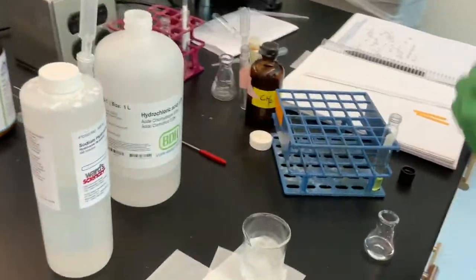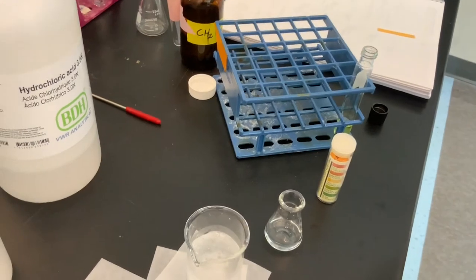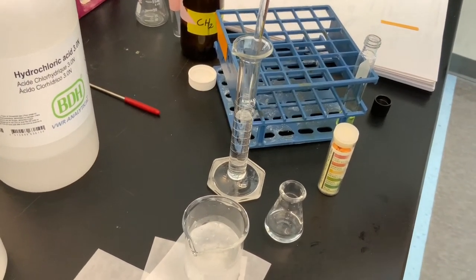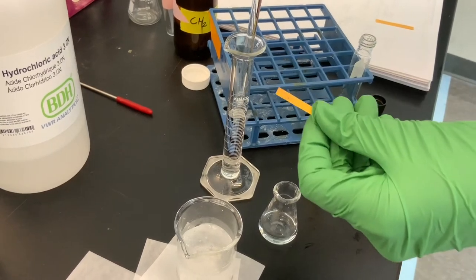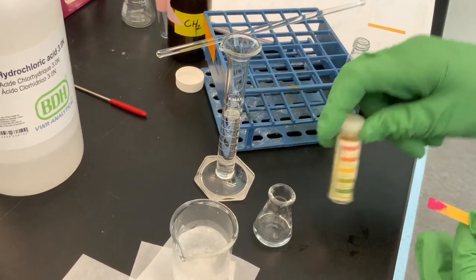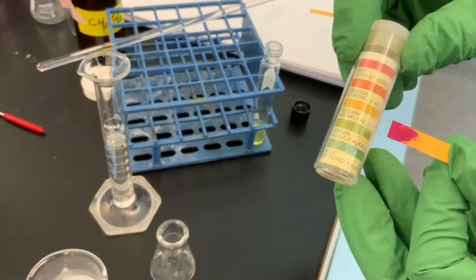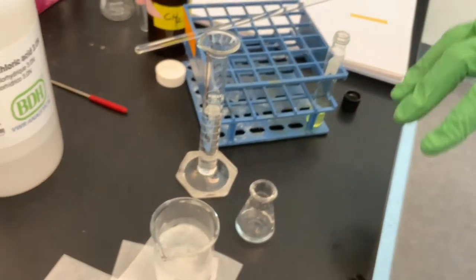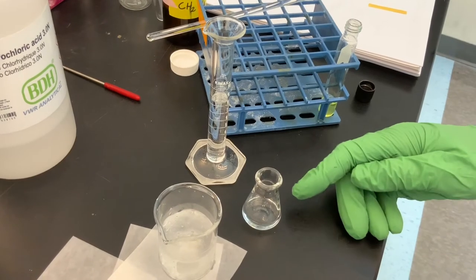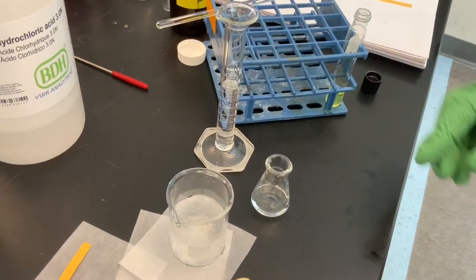All right, now obviously, since this is 3-molar hydrochloric acid, it's going to have a very low pH, and let's just convince ourselves of that. Here's the 3-molar HCl, and I'm just going to touch the glass to the tip of pH paper. I see that we've got the color red, and if we look at the legend here, red is very strongly acidic, so pH 2 to 0, okay? So at this point, what we can say is that if the pH is around 0 or 1, the majority of the benzocaine is going to be protonated. And we can actually demonstrate that with the Henderson-Hasselbalch equation, but for right now, you just have to take our word for it, okay?